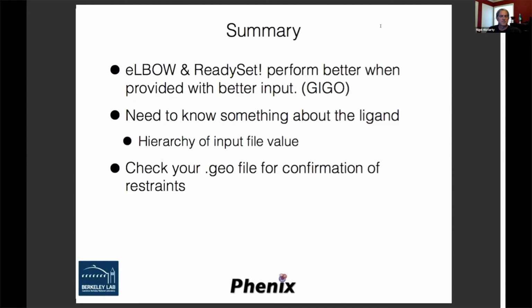Yes, that's a very good point, Jane. There is the ERRASER tool that in theory does automated rebuilding of nucleic acids. I have to say at the moment it doesn't work, because that code has not been maintained by the Stanford group, so it doesn't currently work. We've encouraged them to try to fix it, but right now I don't think it's available in the GUI. But yes, it would be great to get that working because ERRASER is a powerful tool.